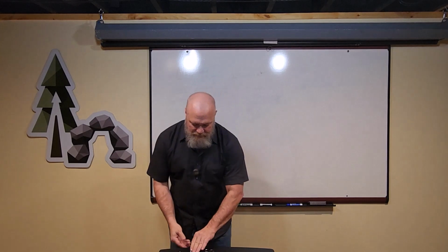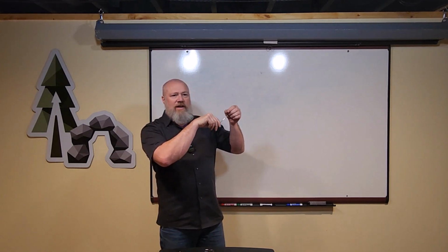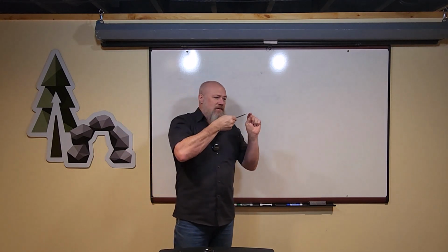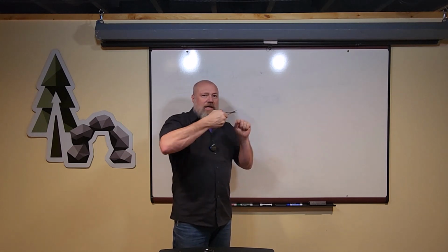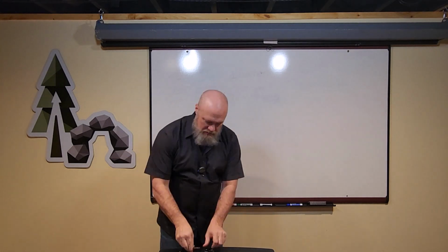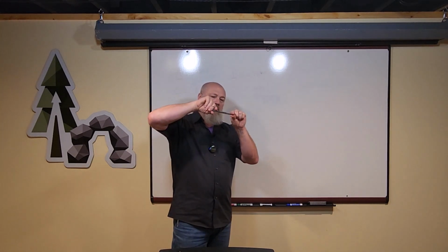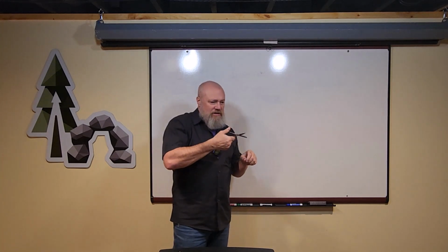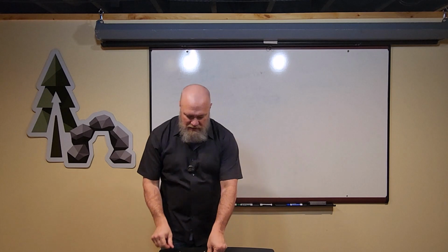Let's say I've got a neurovascular structure and I want to separate some of the deeper veins from the arteries or the nerves, and they're all in a bundle. I'll put my scissors in, especially the small sharp ones, and then open them up. And I use them to prise apart some of the layers of tissue I want to see. So the scissors go in, and then I prise them open. And this is really handy for separating in sequential movements, separating fascial planes.